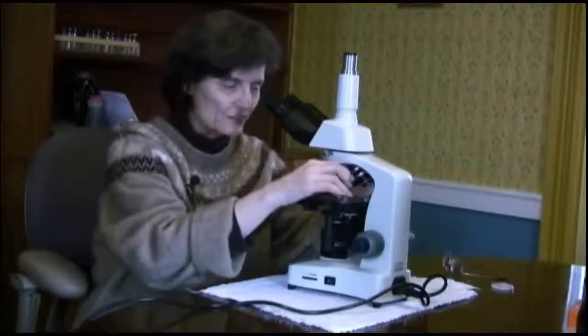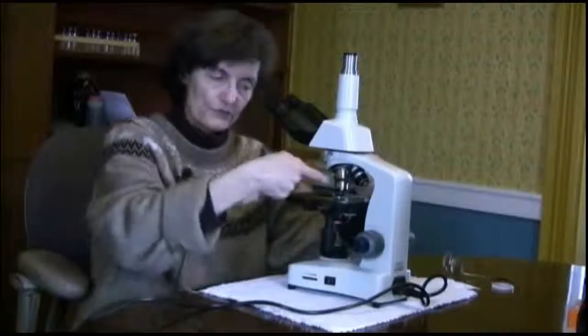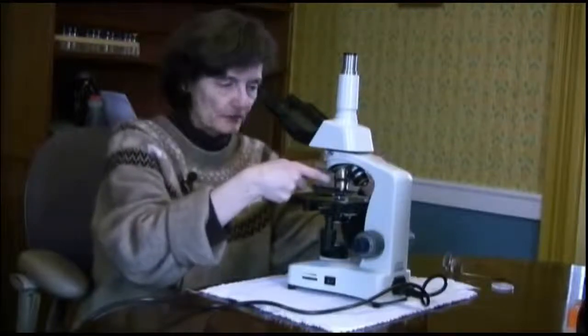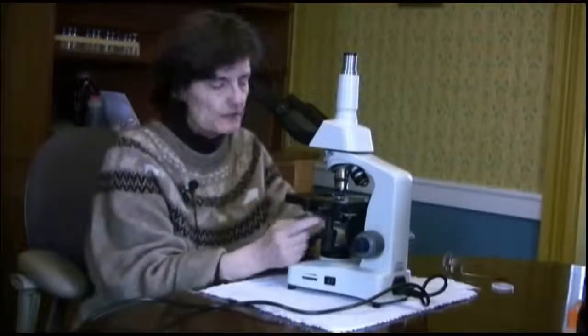All of the quantitative work that we do will be done at this 40X objective. Of course, 40X objective with 10X eyepieces gives a total magnification of 400.